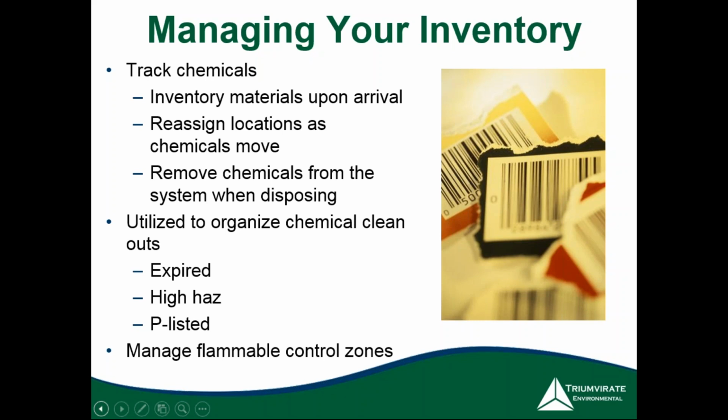Otherwise, that stuff just ends up in the recycling bins or going out as chemical waste, and then it doesn't get scanned out, and you get a runaway chemical inventory and a buildup of chemicals that aren't actually there. And when that happens, you can put yourself into some reporting categories that you don't necessarily need to be in, but your inventory is telling you have to be in just because it wasn't managed correctly.